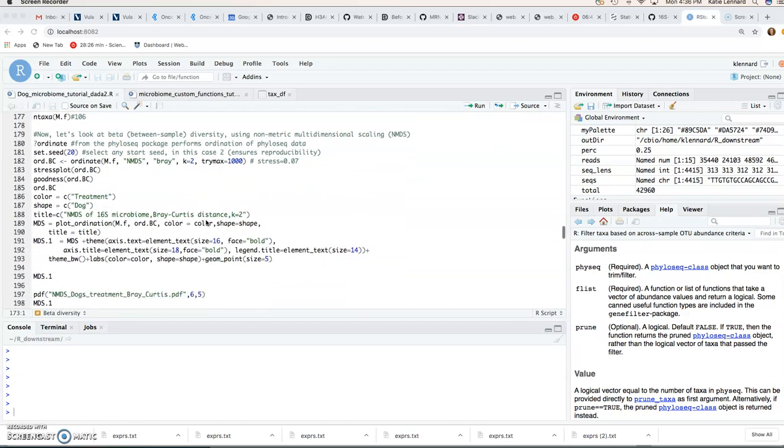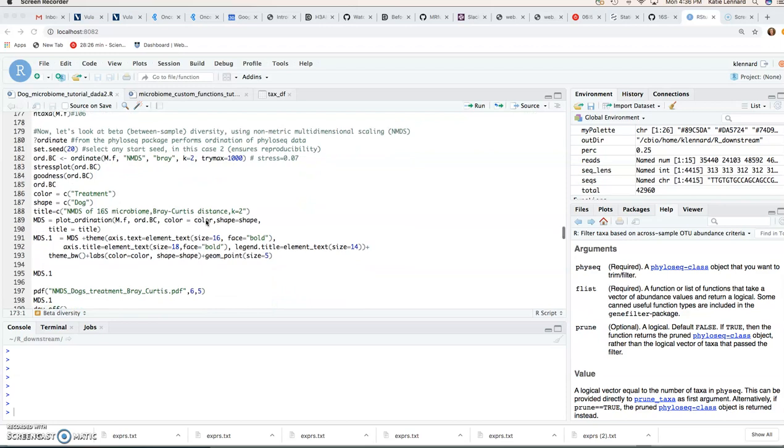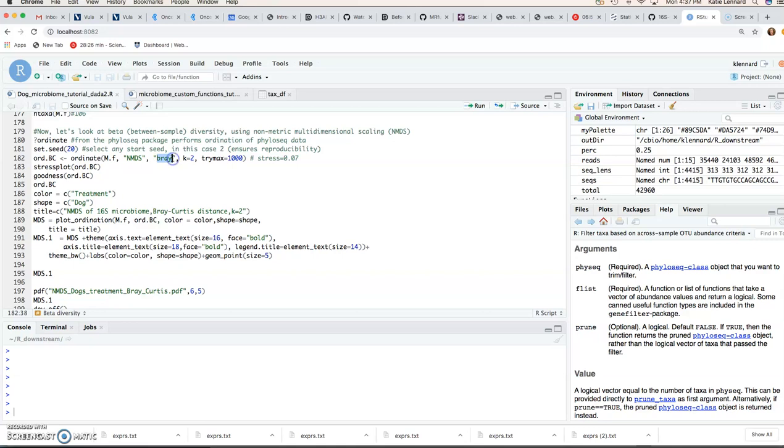So now we're going to do our beta diversity plot, our ordination, and we're going to use non-metric multidimensional scaling for this, and we're going to select Bray-Curtis distance.